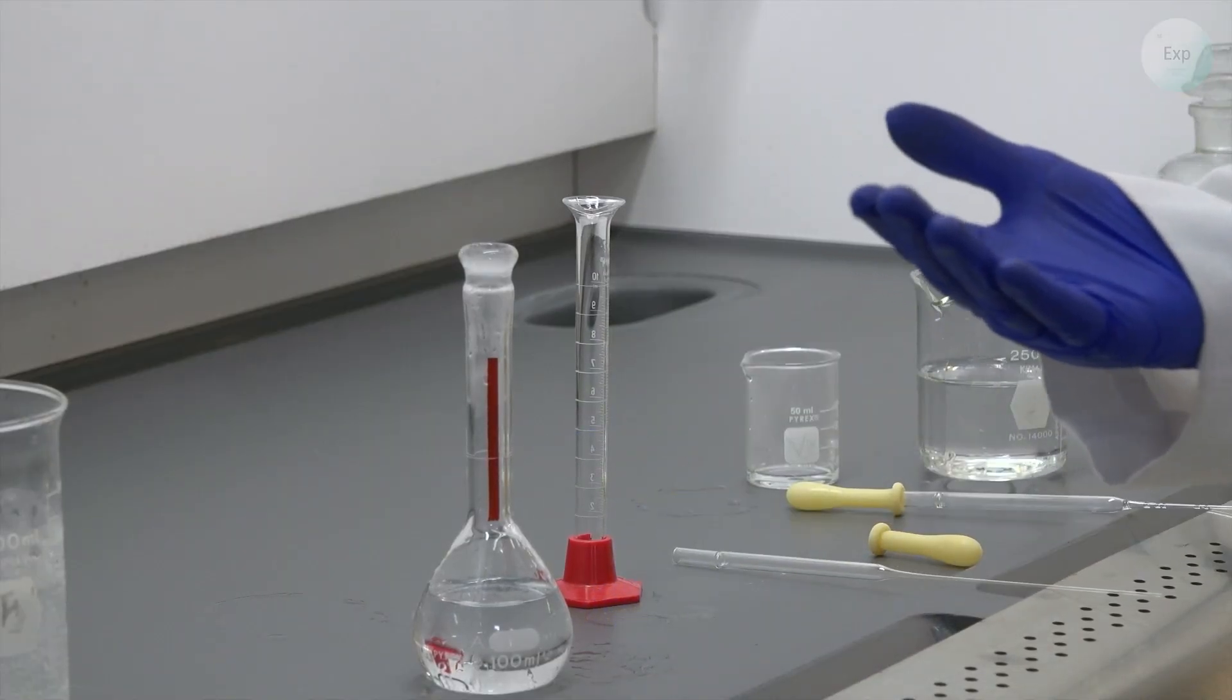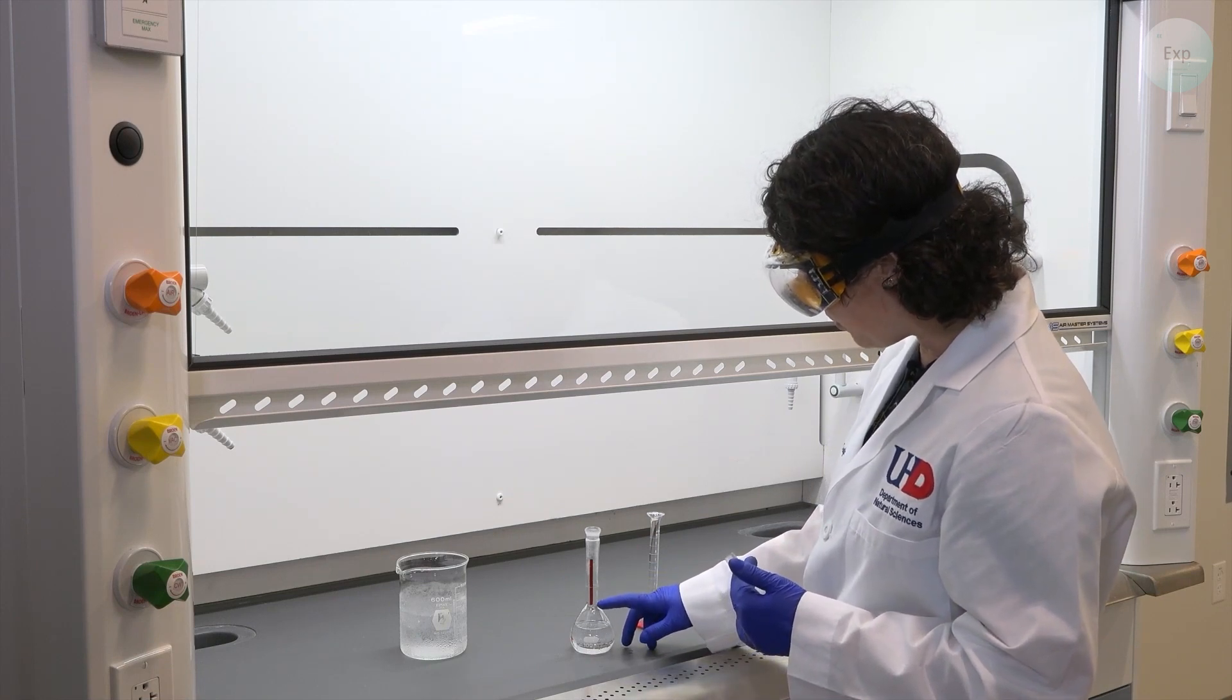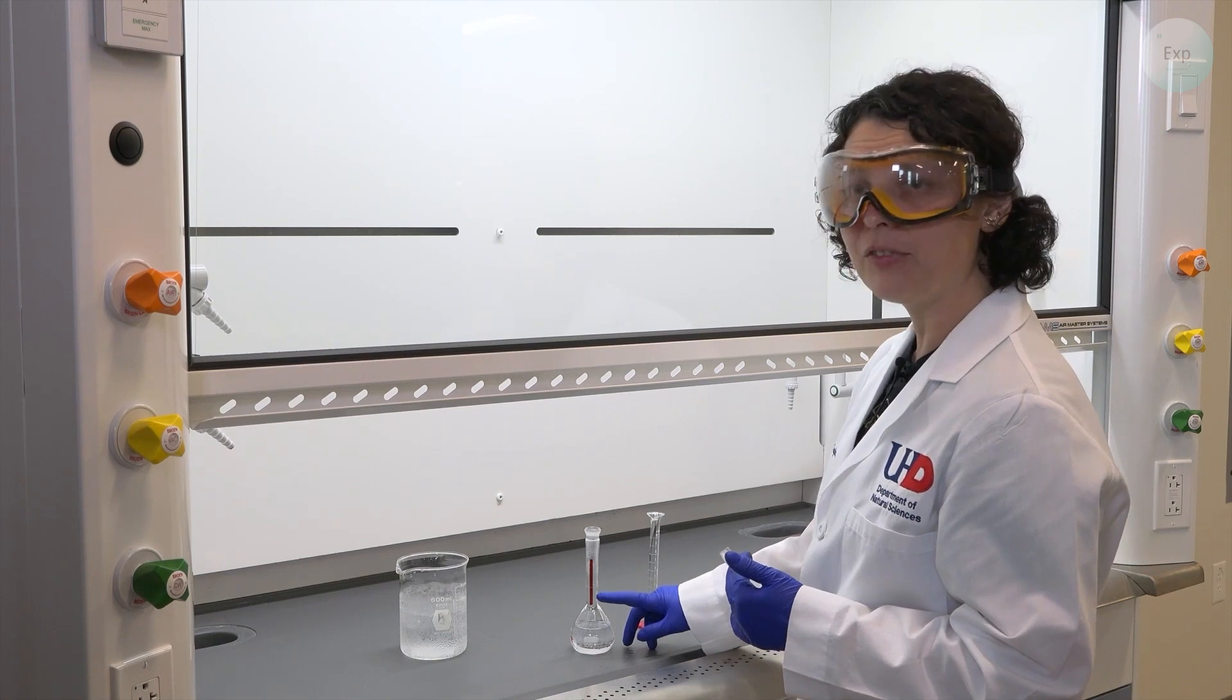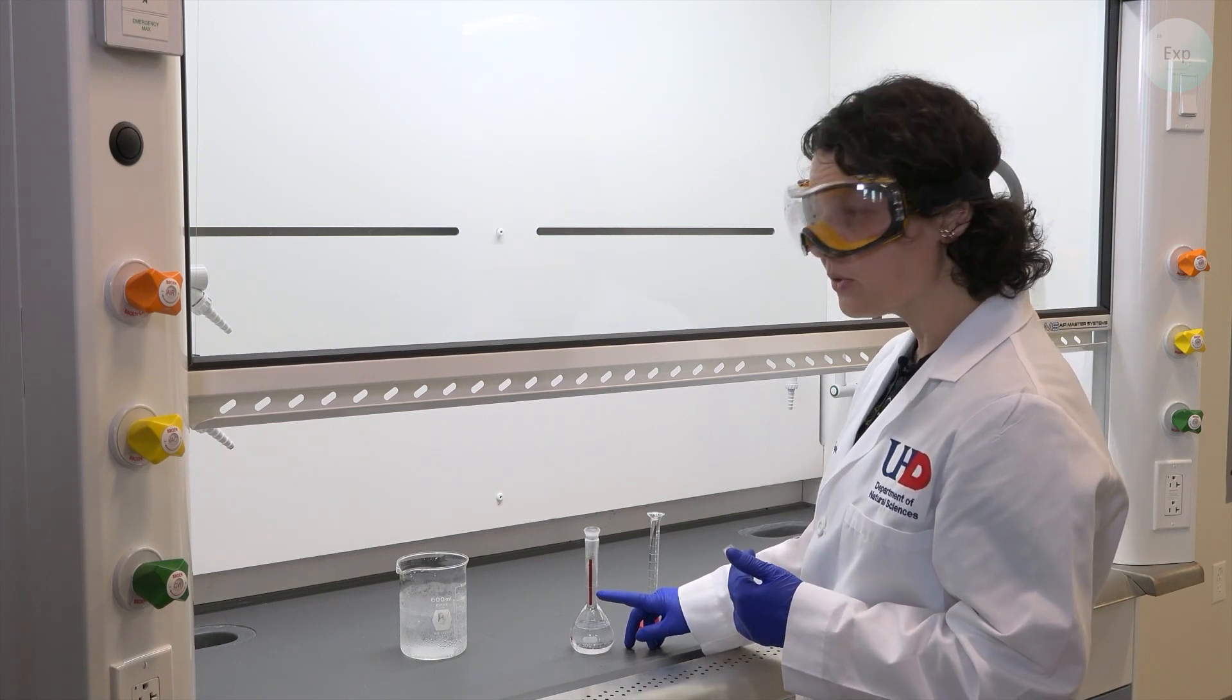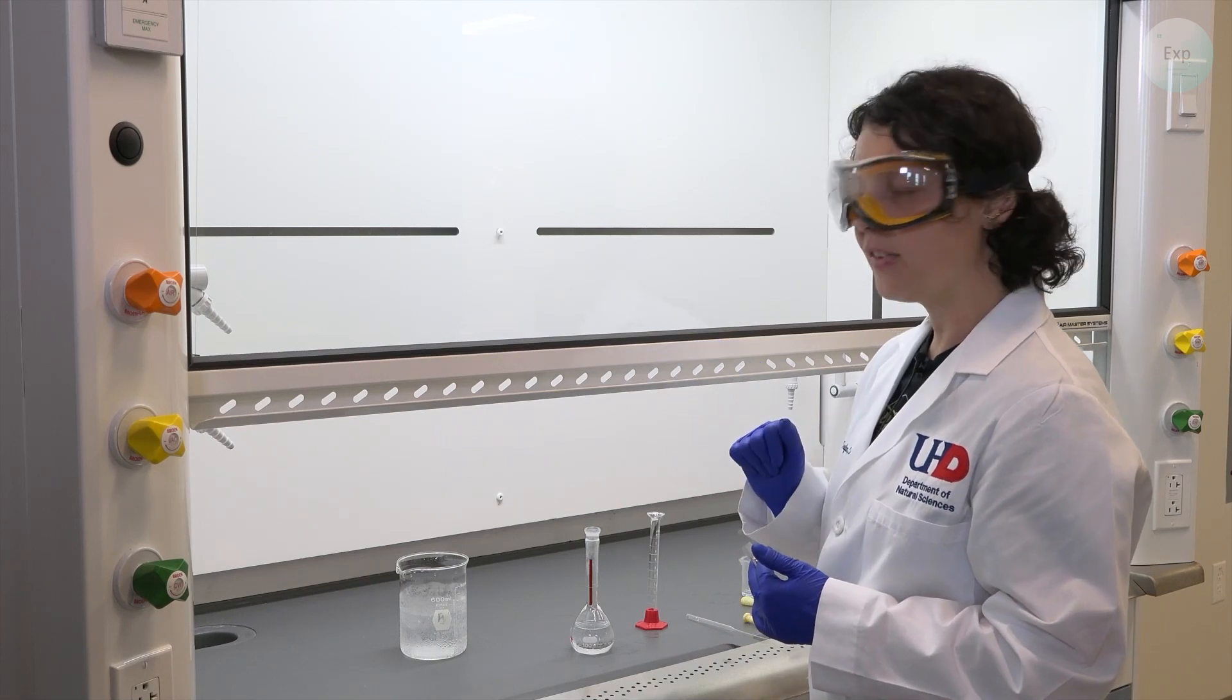So the next thing that we do is simply add water. Add a little bit of water, swirl it, and then when we get close to the neck, we can add a little bit more, but definitely slow it down. And when we get close to the marking, then we switch to a pipette to get the meniscus exactly at the marking.